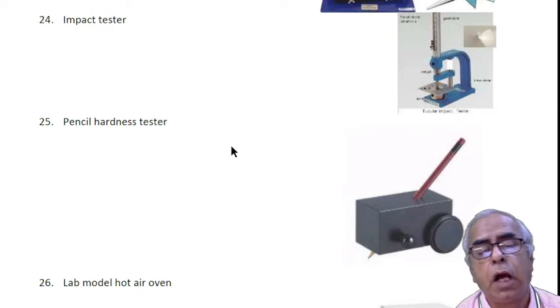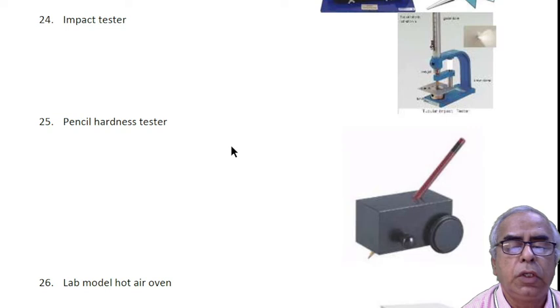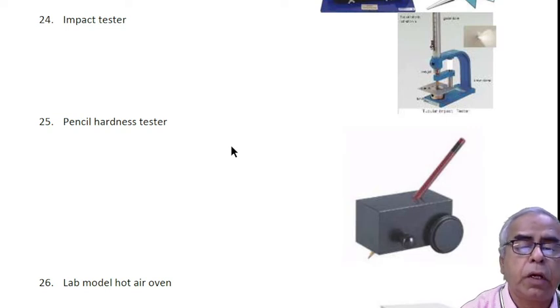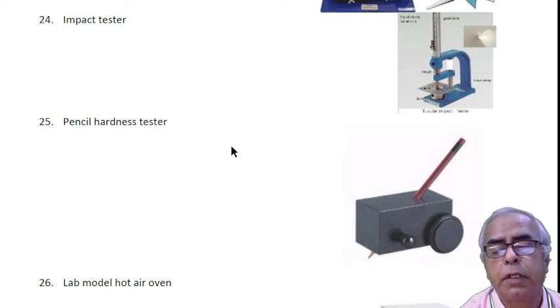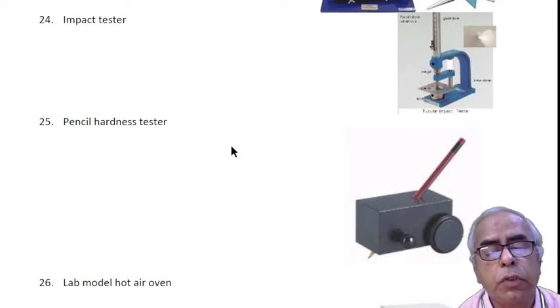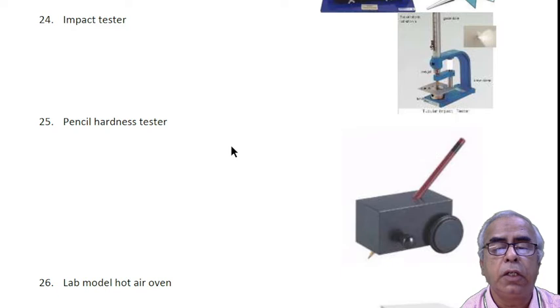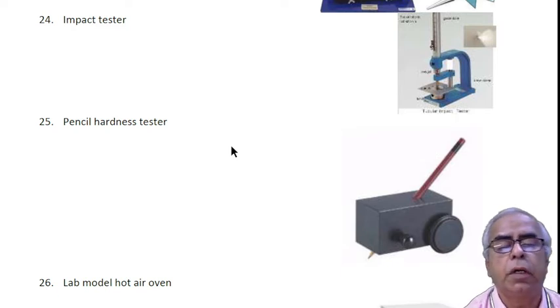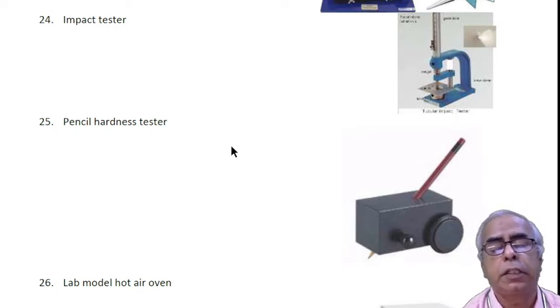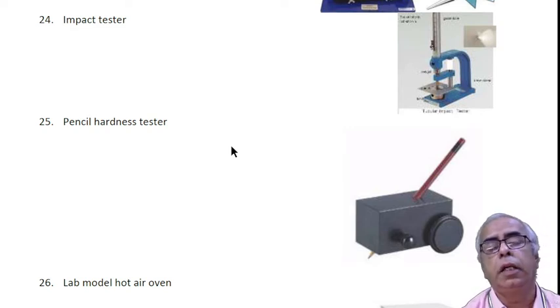The pencil hardness test is useful for checking the hardness of the paint film. The pencil can be used to tear the paint film. We have various grades like F, H, 2H, 3H, 4H, 6H. Normally a paint film is expected to pass at least 2H, so the paint film is hard and cannot be easily torn with a sharp edge.